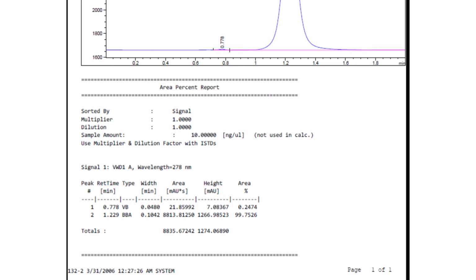And we want to take that data, so we want to put in the concentration of our standards, 250 parts per million, our retention time, 1.229 minutes, and then our area in a different column. And recording all that data, we'll put that all in the same Excel file and then use that raw data to generate our standard curve and to identify caffeine concentrations in our unknowns.